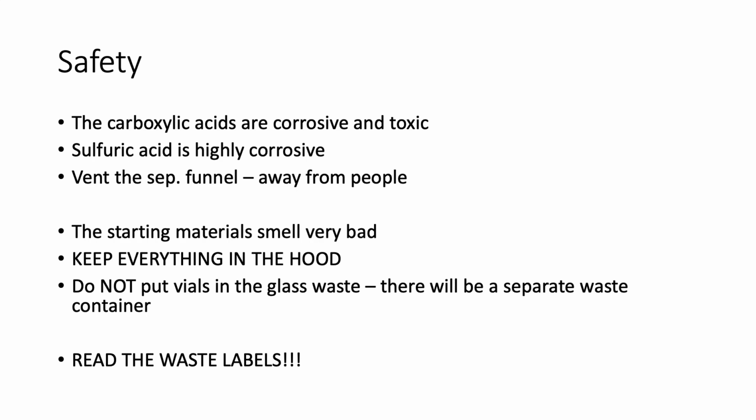The starting materials smell very bad. Your product will smell really nice, but it'll still smell a lot. So keep everything in the hood. This is a very, very smelly lab. Even if you keep everything in the hood, if you're walking by whichever bay is doing this, you will know. So we want to limit the amount of fumes that get out into the lab. Keep everything in the hood.